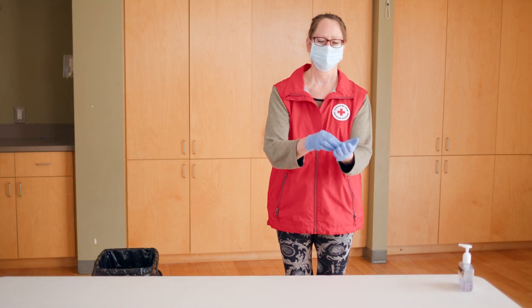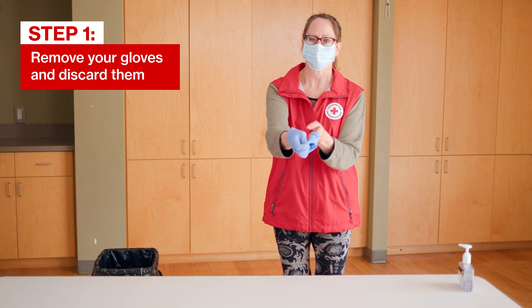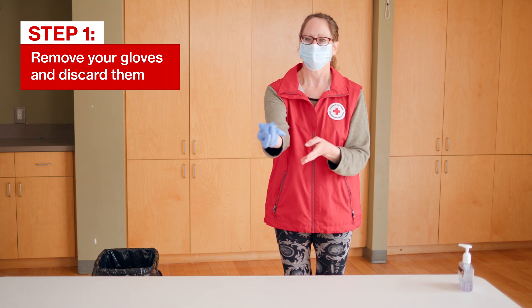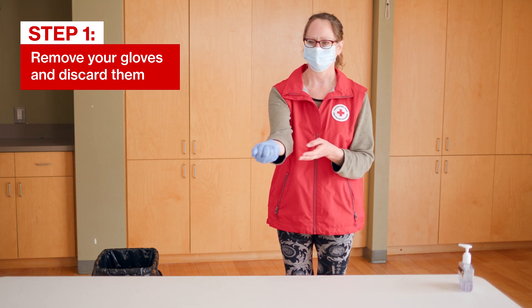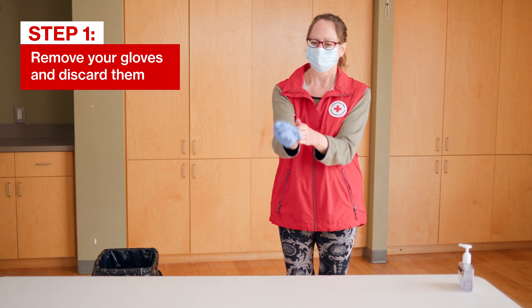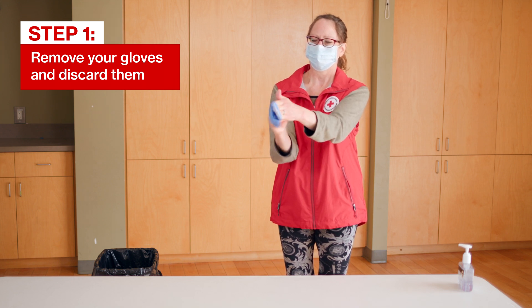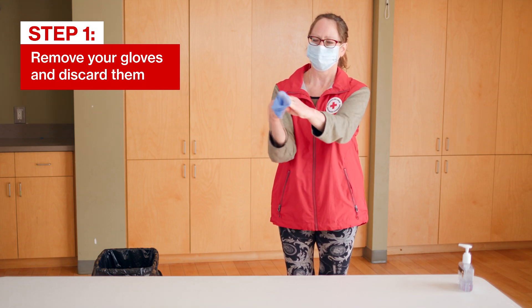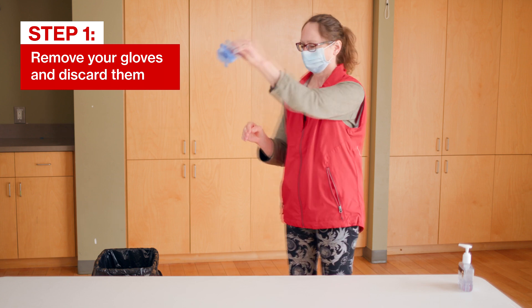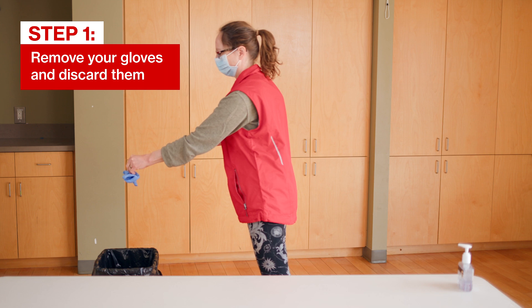First, slowly peel the glove off, turning the glove inside out. This ensures any contaminants remain inside the glove. Next, slide your fingers of your ungloved hand inside the remaining glove at your wrist. Peel off the second glove over the first glove, being careful to avoid contamination from your gloves. Discard them into the appropriate waste container.